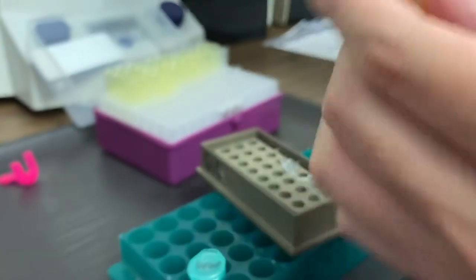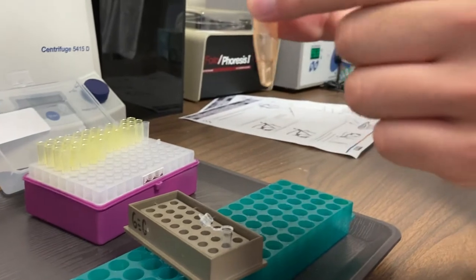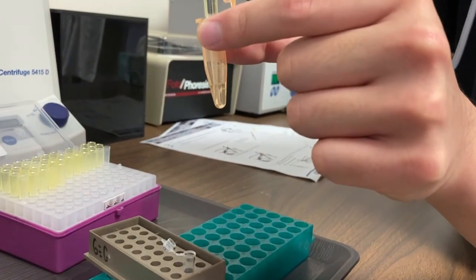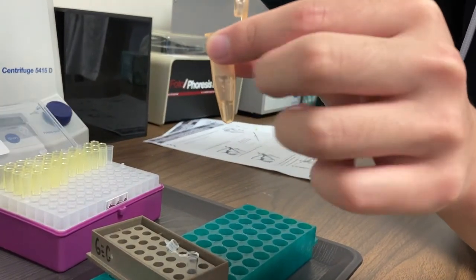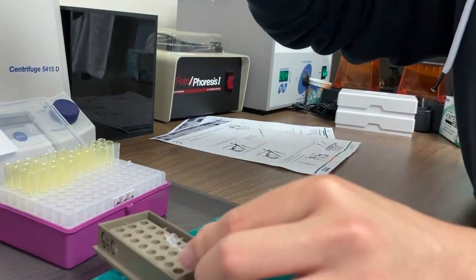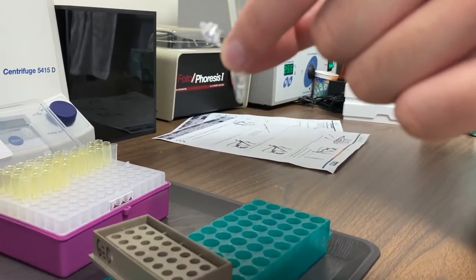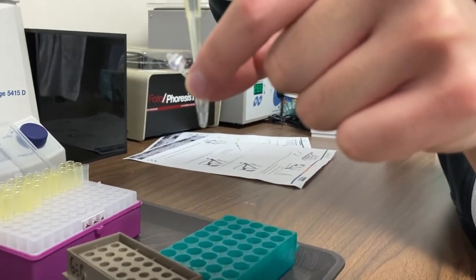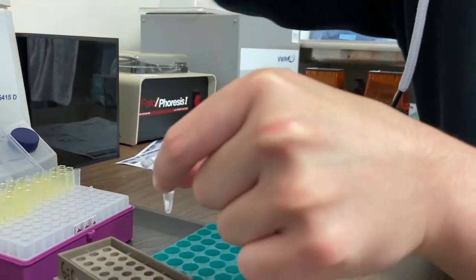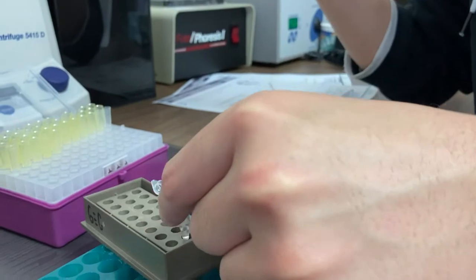After that, we'll get a fresh tip, and we'll add our primer mix. What the primer mix does is it allows us to make millions of copies of our exact target DNA. We don't want to make millions of copies of any DNA. The primer mix allows us to be specific about what we're amplifying.